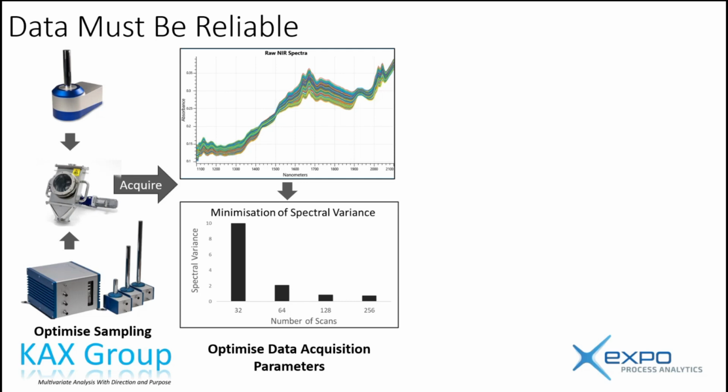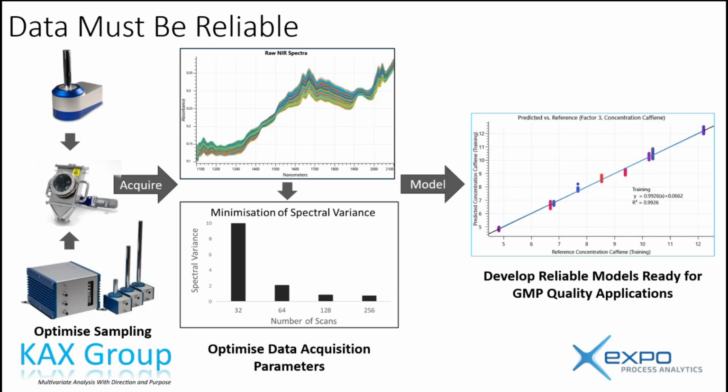The speed of data collection, whether we want to look at unit doses, and that's going to look at how we time our systems. But we should do some sort of static measurements as well in the beginning to understand, okay, if we measure at this speed, what sort of variability are we generating with respect to a static sample? And that will help us to understand how to best optimize or calculate the number of co-adds that we're going to do in a continuous way to generate models that look like this.